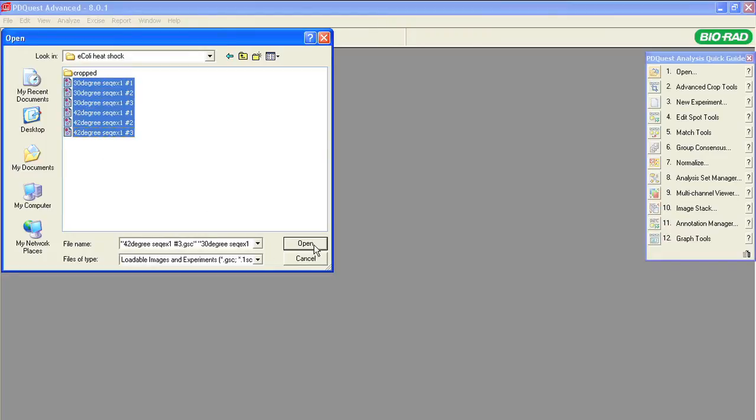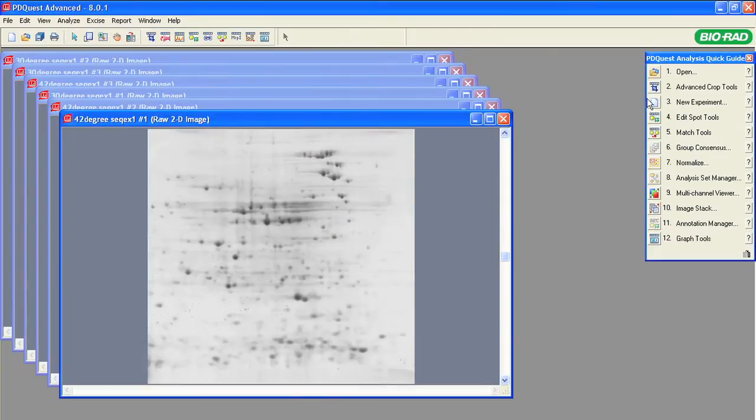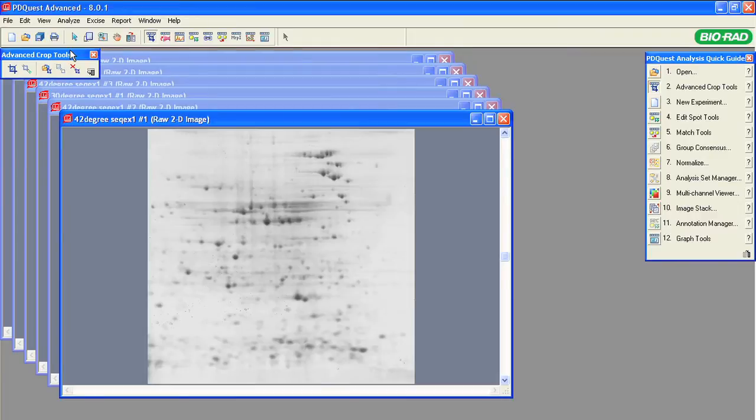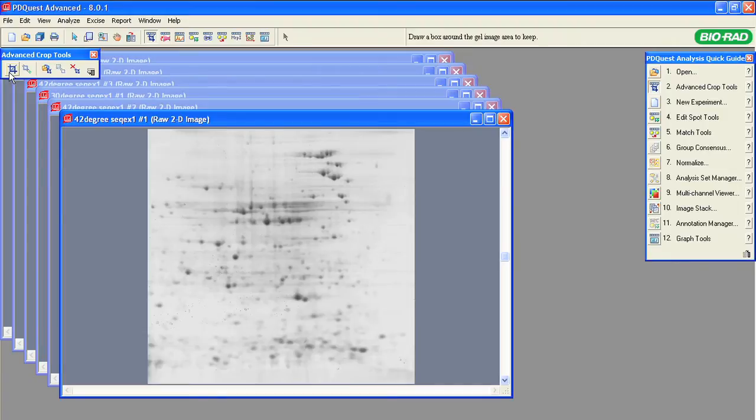Open the set of images that you want to analyze. Select Advanced Crop Tools from the quick guide. Notice the Advanced Crop Tools bar opens at the top left of the display area.